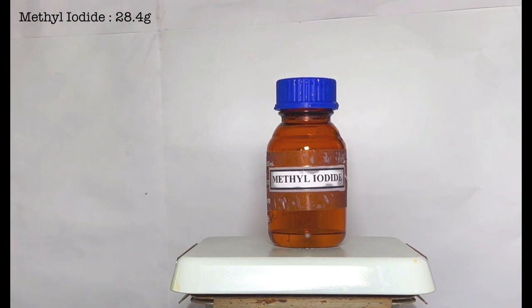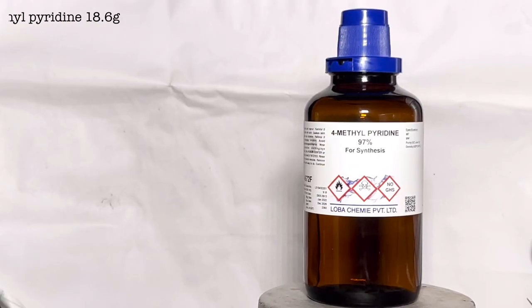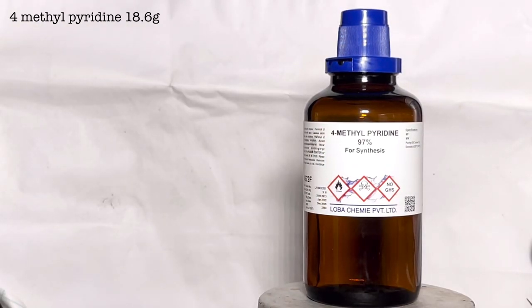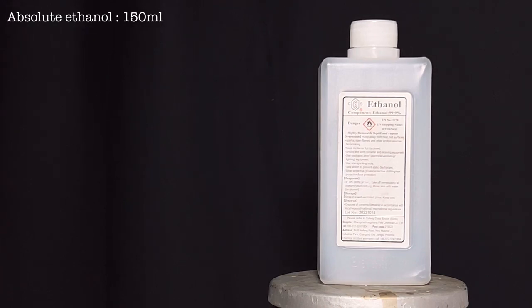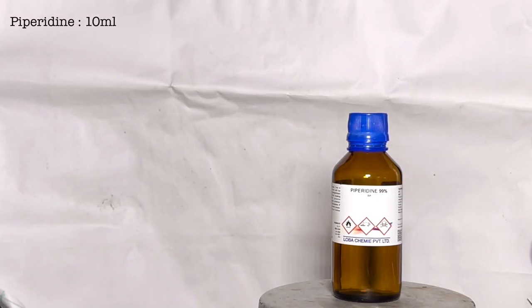For this experiment we will need 28.4 grams of iodomethane which was made in one of my previous videos, 18.6 grams of 4-methylpyridine, 150 milliliters of absolute ethanol, and 10 milliliters of piperidine.